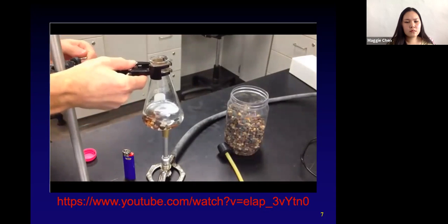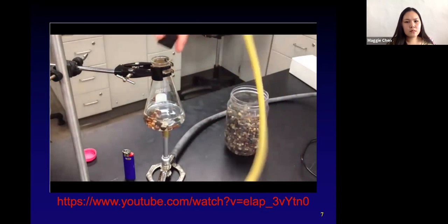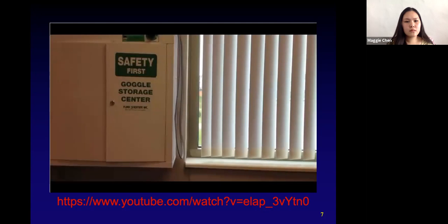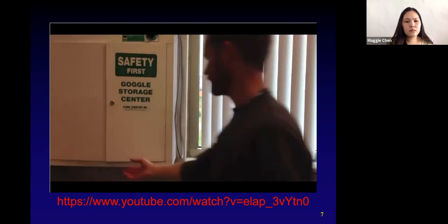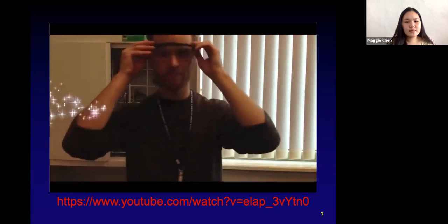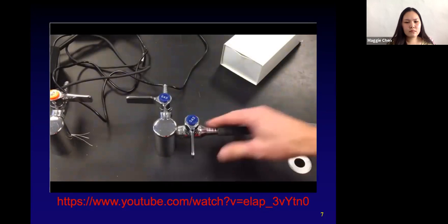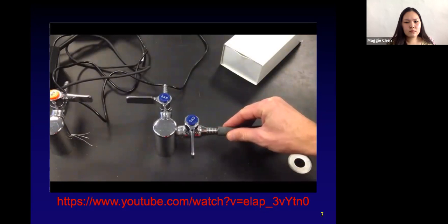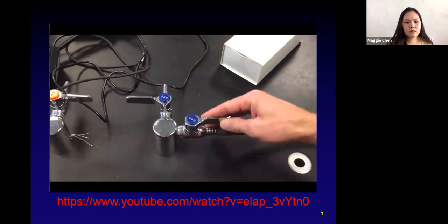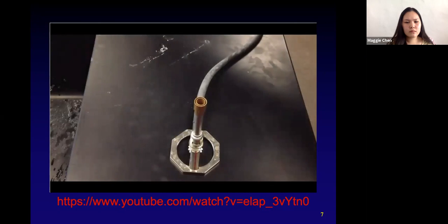Reset your Erlenmeyer flask. Put the cover back on. Put on a sweet pair of goggles. Now it's time to light and adjust your Bunsen burner. So the first thing you want to do is connect the Bunsen burner tube to the gas. Turn the valve on. Go ahead and light your Bunsen burner.